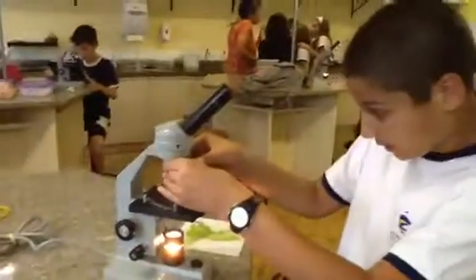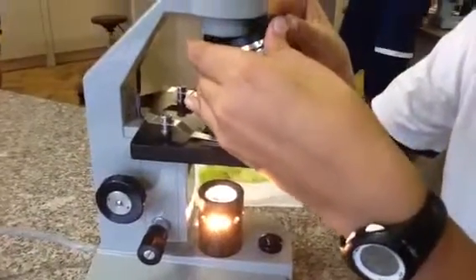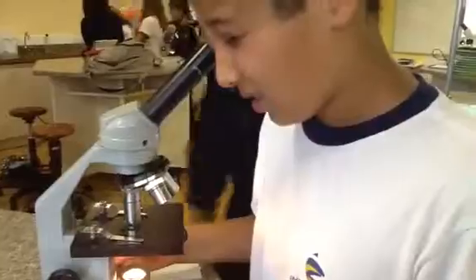Our final step is to move it up to the highest objective lens slowly so we don't break the slide cover. Now that we have finished placing it, we're going to look through and focus. When we get a good picture, we can see.